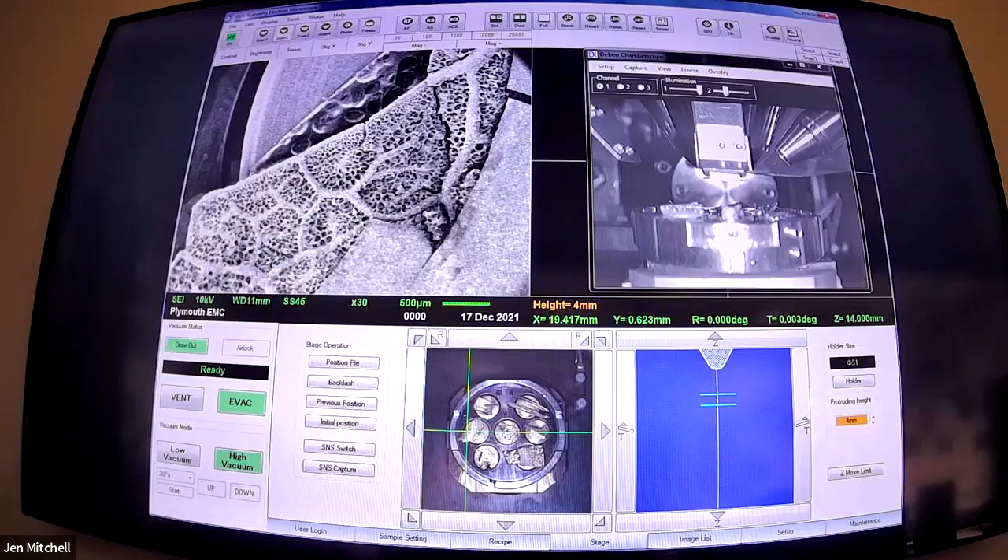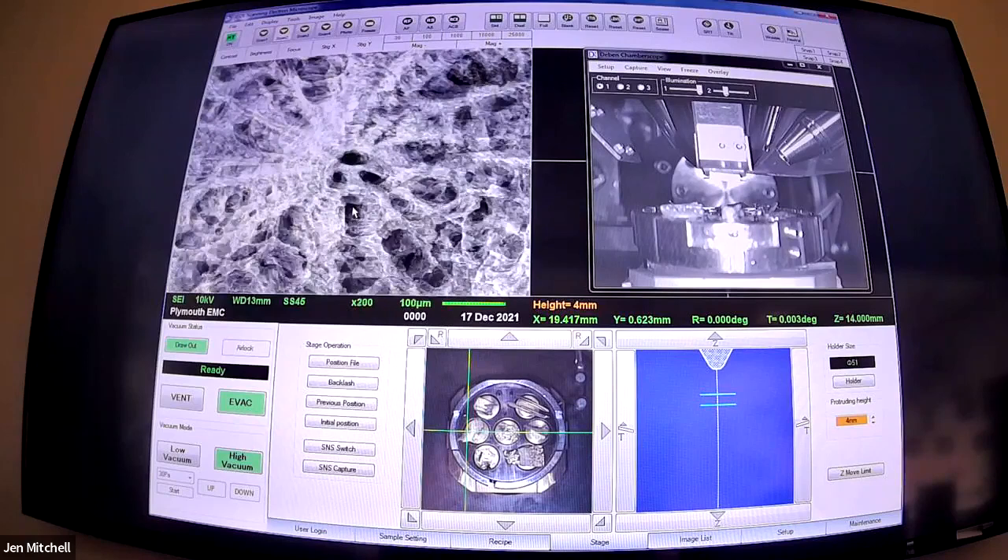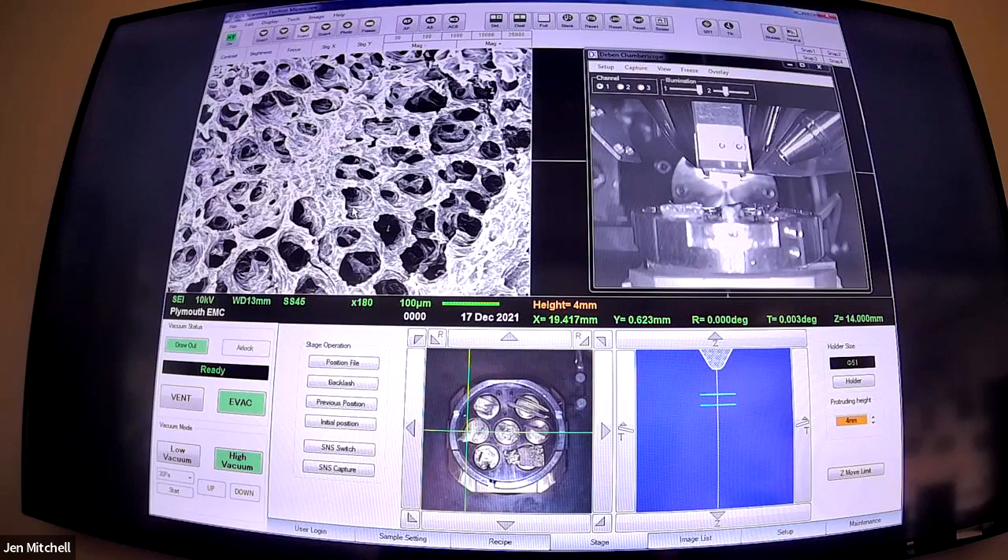It works kind of the same as all the other microscopes do - we have to zoom in, get it in focus, zoom out a little bit, and then the whole picture's in focus. We'll be taking photos and we'll put one in a booklet for you. If you do have any ideas of what this is, talk in the chat. I'm sure we'll unveil the mystery at some point.